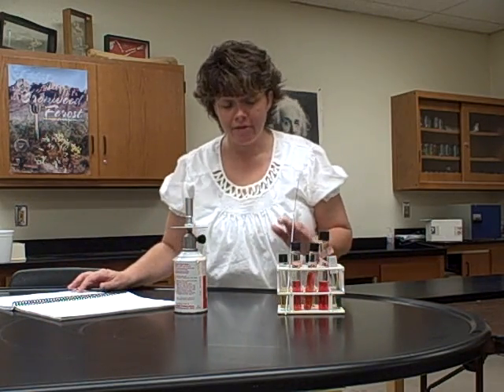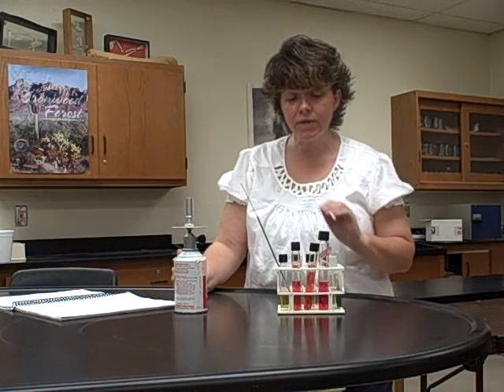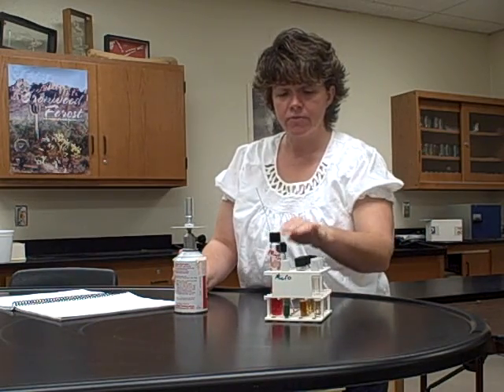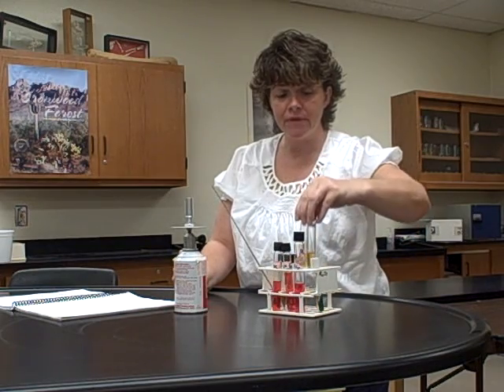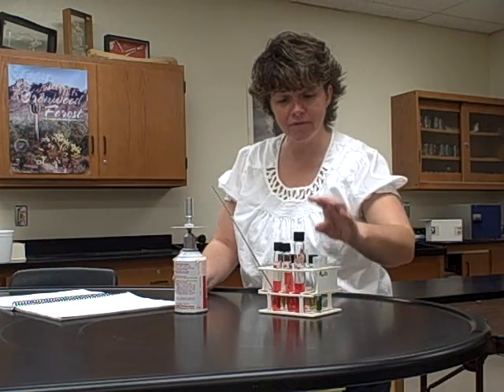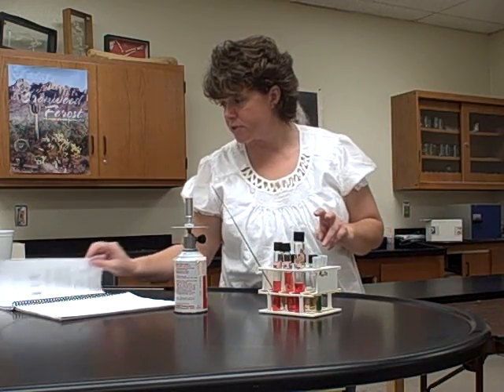Now for this particular experiment, just like the last one we just did, we're going to have lots of tubes. In this case, we have 3 of what we call fermentation tubes. Then we have 4 MRVP tubes, and then we're going to add the Simmons citrate. So far we've got 8. And then you're going to have at least 2 cultures, if not 3, and it depends on how they're assigned.